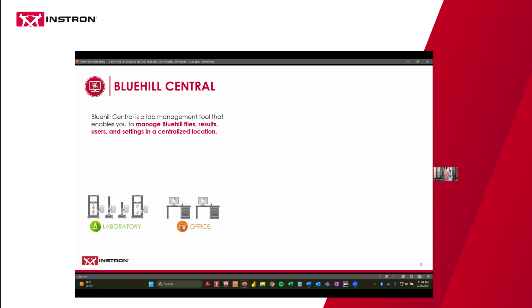You can see this diagram going back and forth, which shows the architecture. It is known as a client server architecture. You can look at these 3 components as the laboratory, the office, and the data center. In the lab, you have the machines themselves, and computers telling those machines what to do and what calculations to run. They're running Bluehill Universal. Because it controls the equipment, that's a client of this client server architecture.